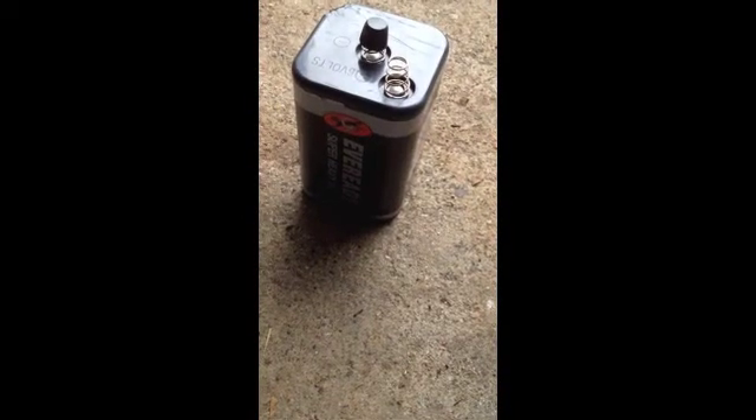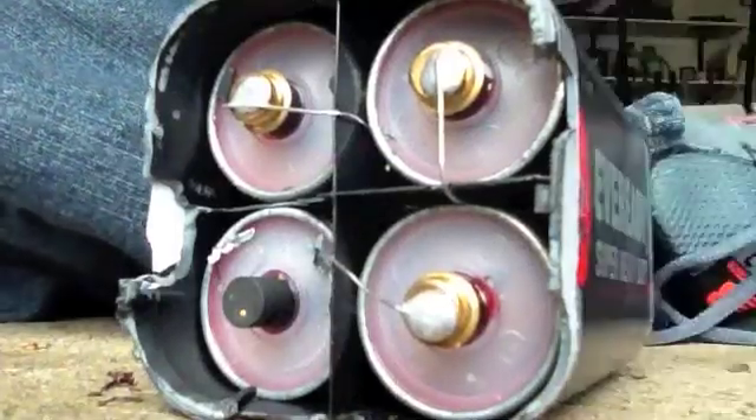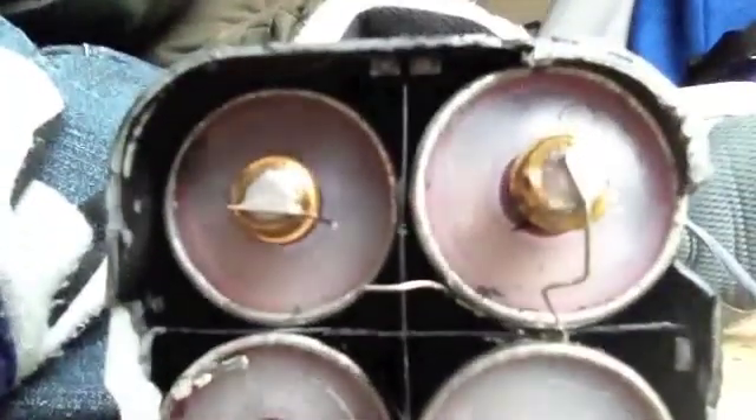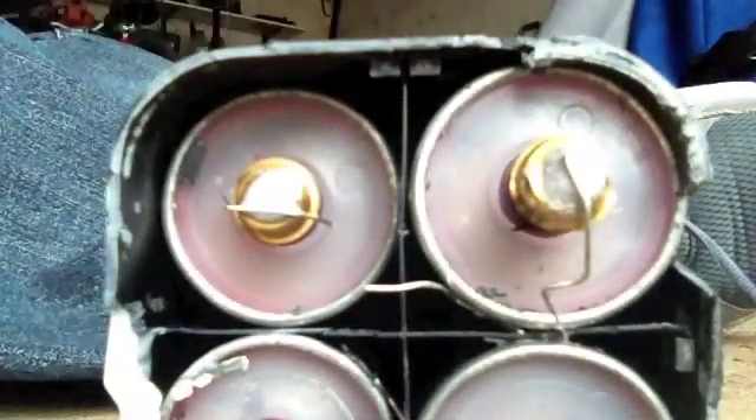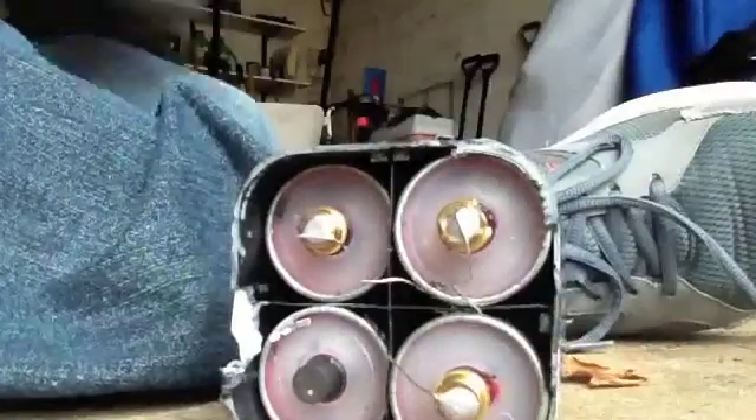This is a super heavy duty 6 volt lantern battery. I'm going to take it apart. So now I've got it open, let's take out this carbon. Now that I've got it open, I'm going to put on my gloves, and we're going to cut the wires because we want these carbon electrodes to be intact.